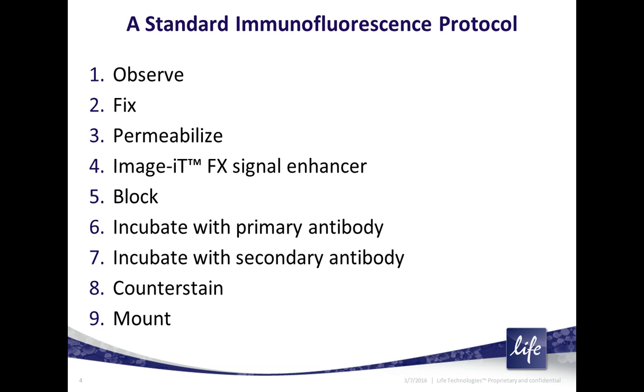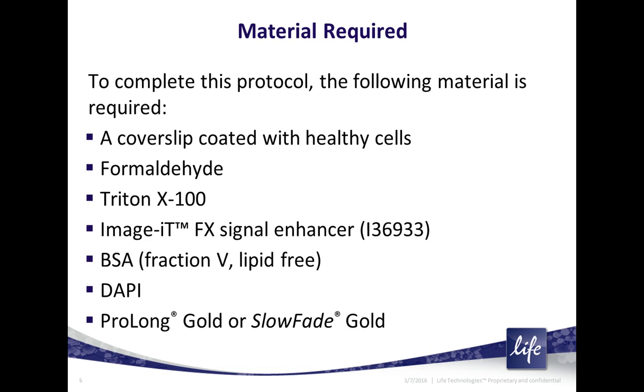Here are the very basic steps in the protocol that you'll be following. Observing, fixing, permeabilizing, doing a blocking, including perhaps with a signal enhancer solution, which I'll talk about. Incubating with the primary and then secondary antibody. Counterstaining if needed, and then mounting your sample on your slide.